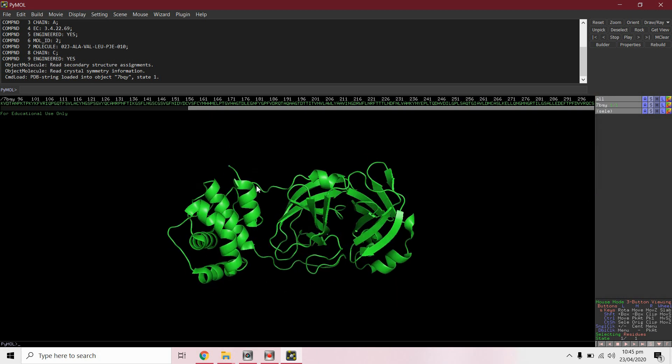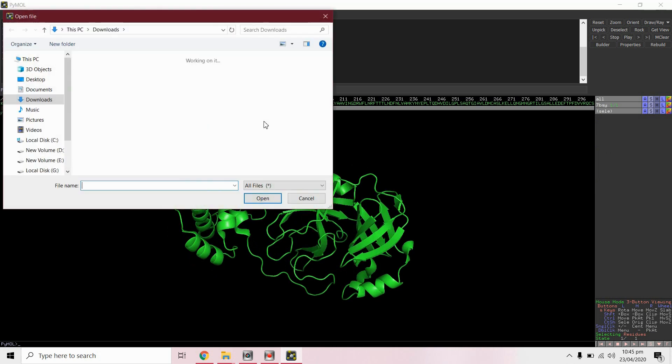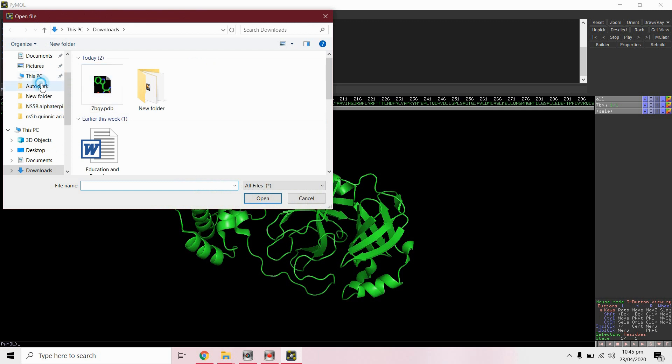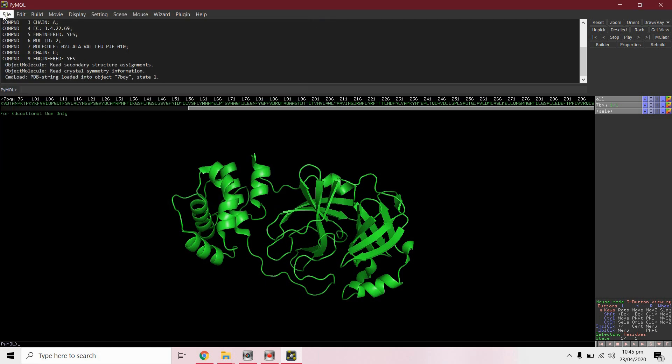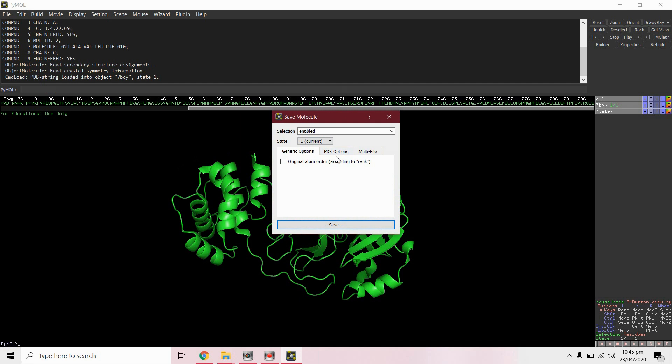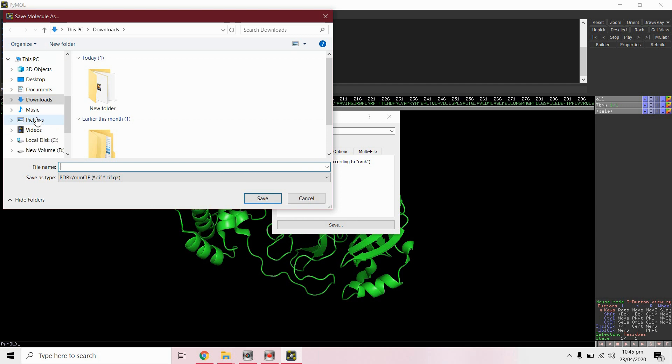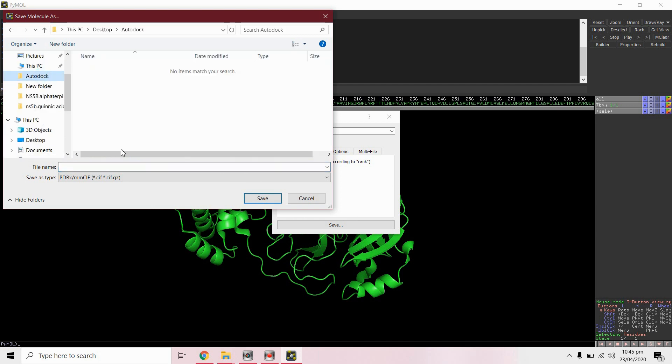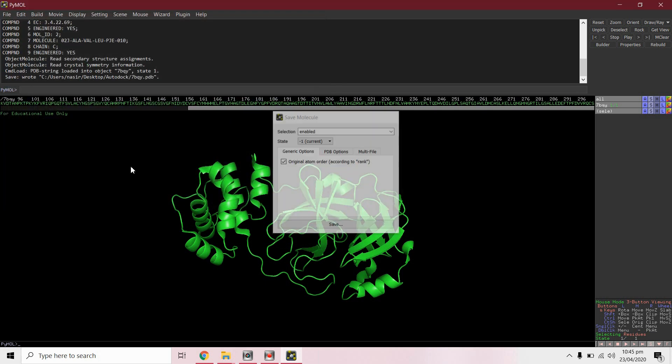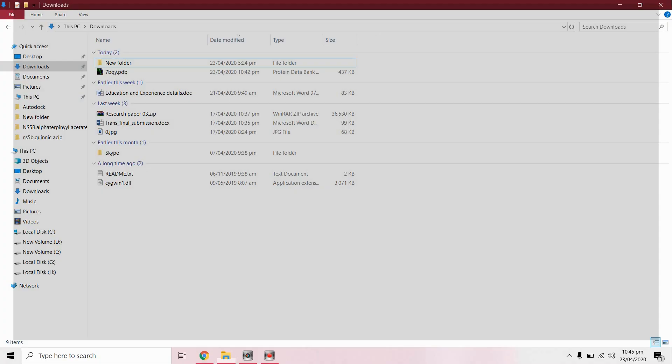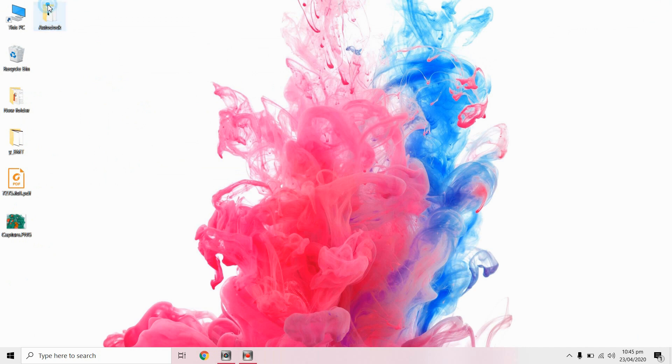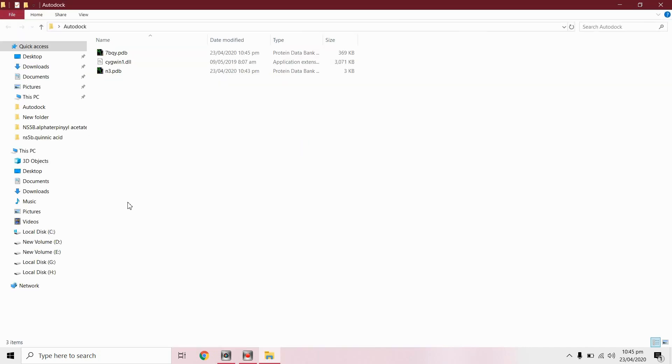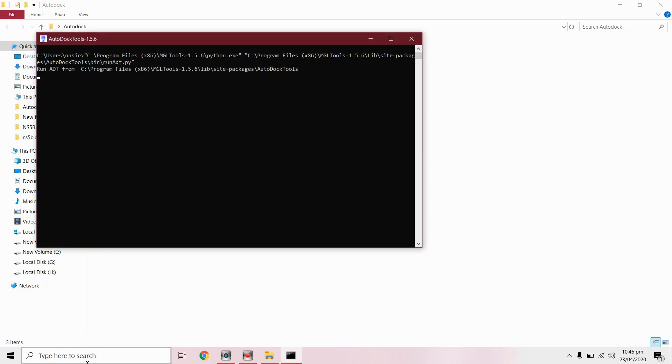We have only protein structure. We will save this in dot PDB format from export molecule. Close this file. For this docking you must have MGL tools. Open AutoDock tools.